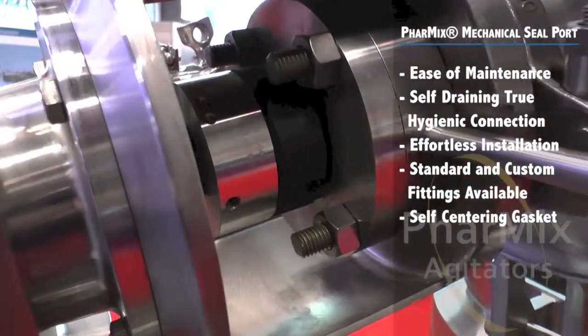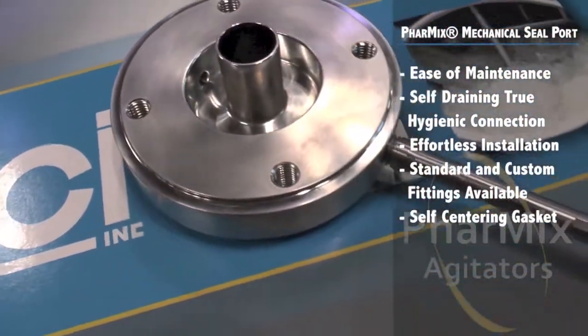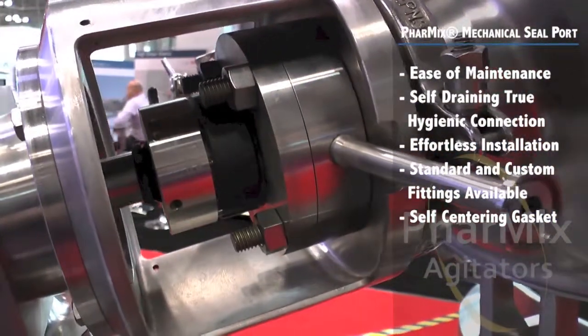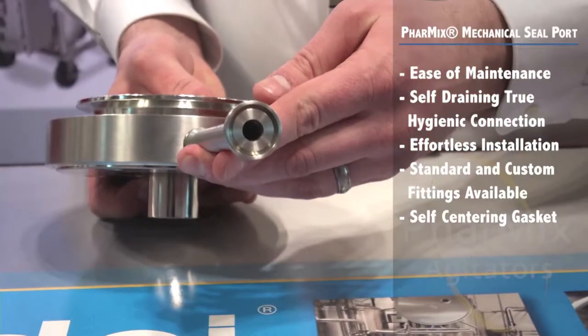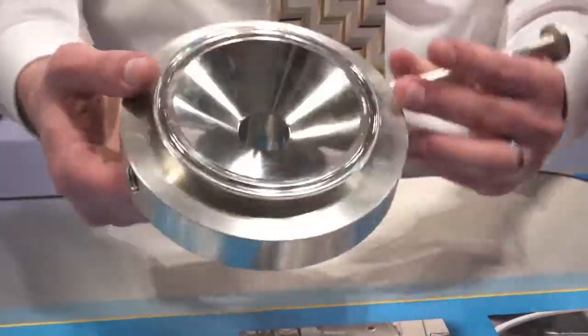The snap-on self-centering gasket design makes installation easy. The low-friction tough steel gasket won't bind, ripple, or compress when tightened. The Pharmix MSP is available in a standard half-inch hygienic tri-clamp fitting connection, and other fitting styles are available.